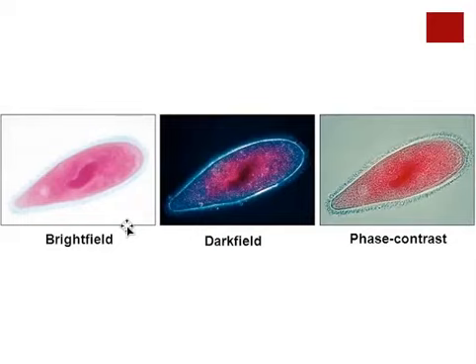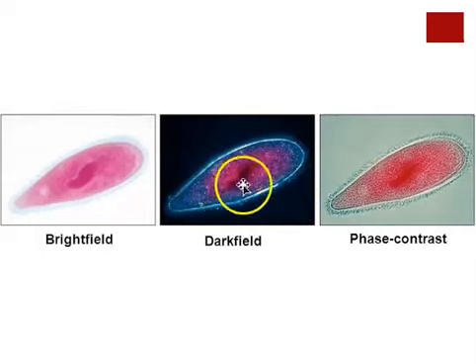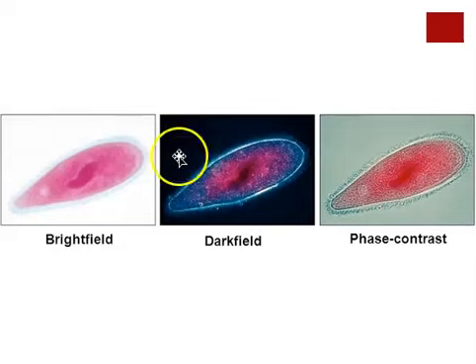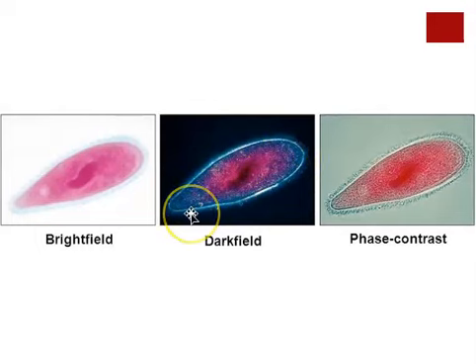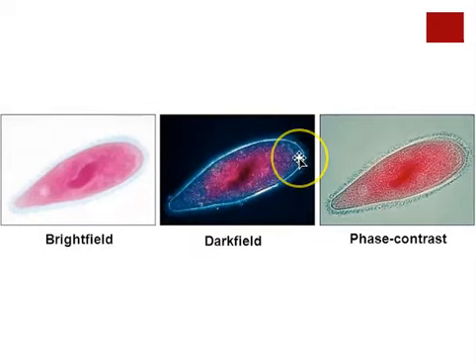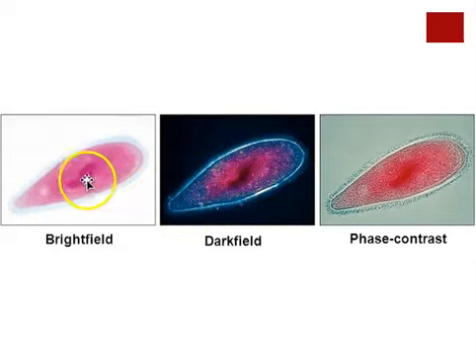Now look at the exact same cell under the dark field option. Under dark field, the object is going to be lighter than the background — the field is going to be dark to black. You're looking at the exact same cell with the exact same stain, but you're getting a different amount of detail. You're seeing different structures under dark field than you can see under bright field. It's just another tool in allowing us to understand the structure of these cells.